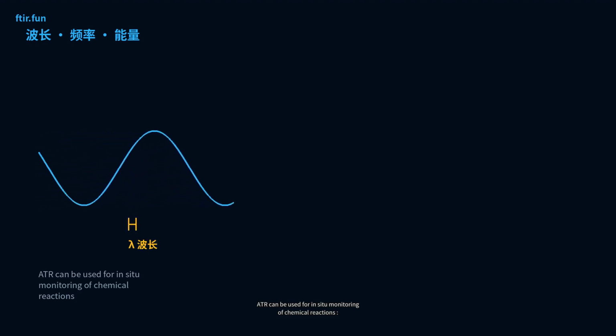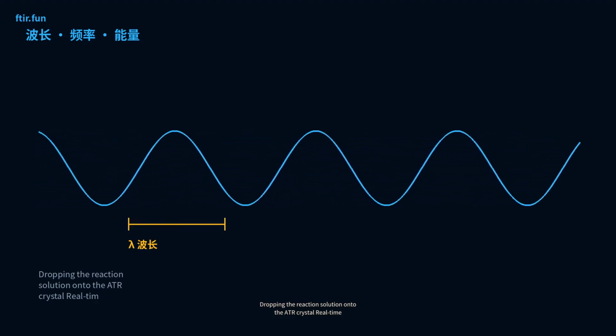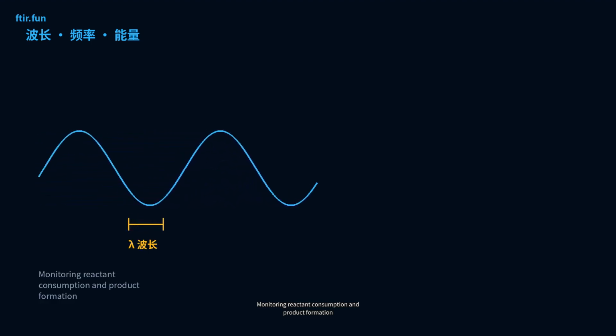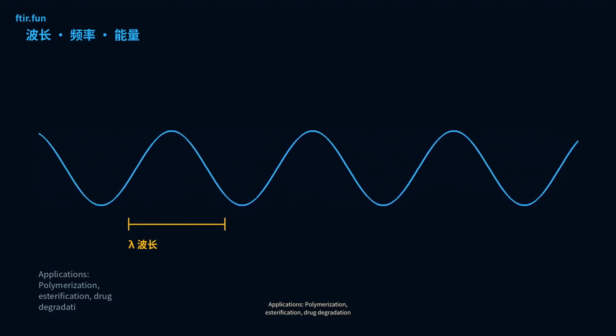ATR can be used for in situ monitoring of chemical reactions, dropping the reaction solution onto the ATR crystal. Real-time spectral acquisition, 1 spectrum every 30 seconds. Monitoring reactant consumption and product formation. Applications: polymerization, esterification, drug degradation.